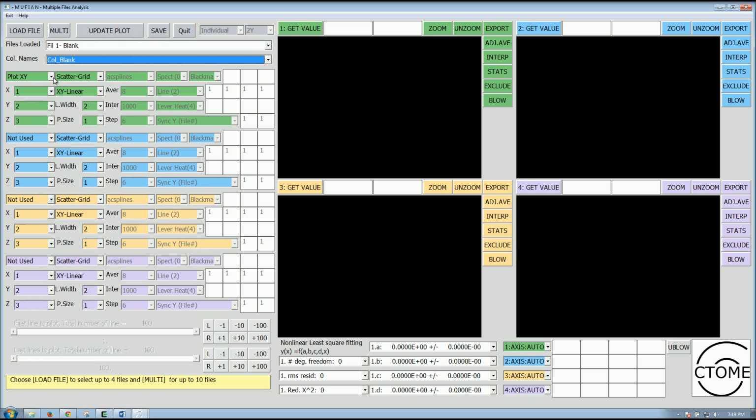Each of these blocks will be described in second videos, and you see that there are drop downs that would be setting the conditions for a given analysis. Each of those drop downs, they are identical. So if you know how to use one, you will be able to use all of those fairly quickly.